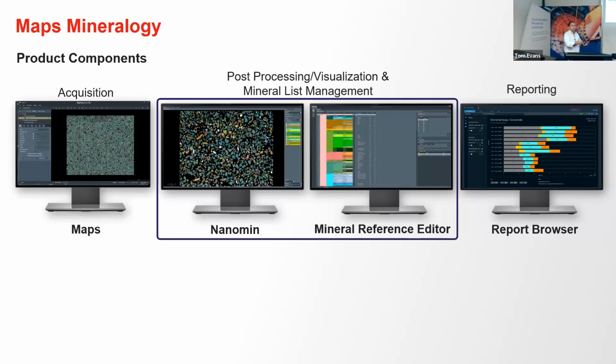Basically, the software is the one that automates the whole process, the whole workflow. There are some touch points, as we have user interfaces, where people can do input. You have your input into, for example, the acquisition, which is done in MAPS. You can select, for example, the acquisition settings, and there is a whole bunch of automation in terms of the stitching of the tiles and creating a very large image out of individual fields of view.